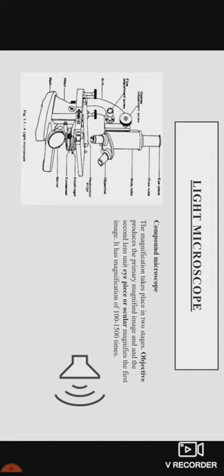You can adjust any one of them, and eyepiece has 2 replaceable pieces that have the 10 times and 15 times of magnification. Suppose you are using the magnification capacity of objective 10 times and also the 10 times magnifying capacity of eyepiece, then you will see the image 100 times bigger. Similarly, you can use them one by one.